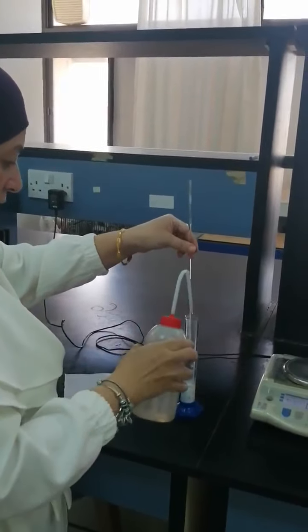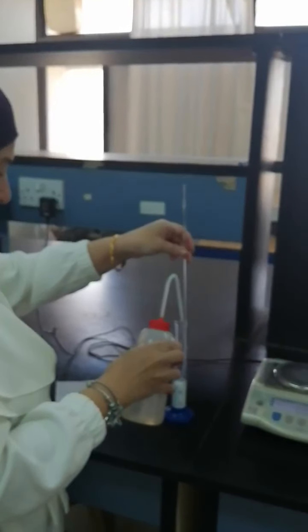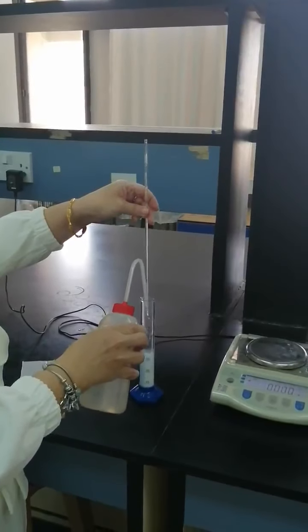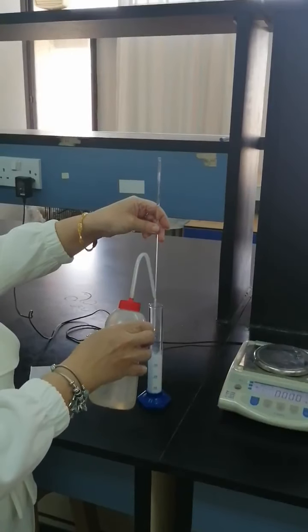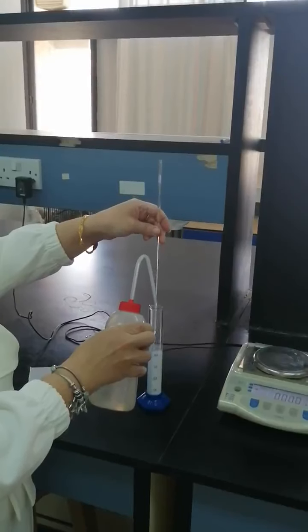To get accurate results, I have to rinse the cylinder, but be careful not to exceed the volume of 50 ml.